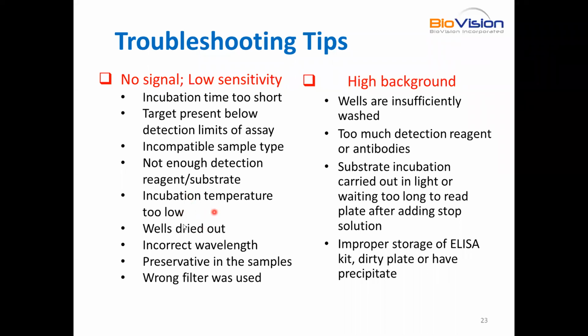Maybe they are not incubating for the appropriate time, the incubation time is short. Maybe after the washing steps, the wells dried out, which we don't recommend because that can significantly reduce the signal. It can also be due to them not reading their plate at the correct wavelength that's appropriate for the assay. Also, the low sensitivity could be due to the preservative in the samples.